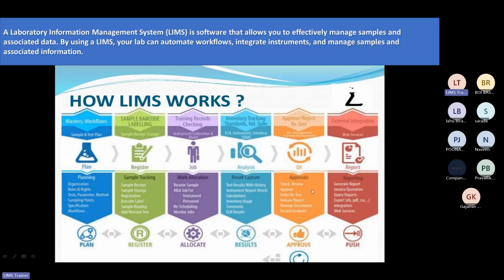Why is this required? Suppose they are planning some new project in the laboratory, or a pharmaceutical industry is planning to launch a new product. They have to calculate how much cost is involved in the analysis, and by utilizing this software it becomes easier. If each and every inventory item is recorded in the software, it becomes easier to analyze that inventory.